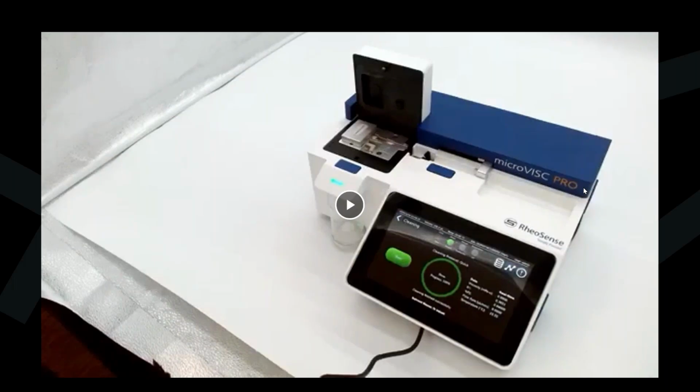We actually have an application note on the viscosity of sunscreen. In that application note, we show that we can measure viscosity at different shear rates, and that shows the shear thinning behavior of sunscreen. So you can access that application note if you are interested in this topic.